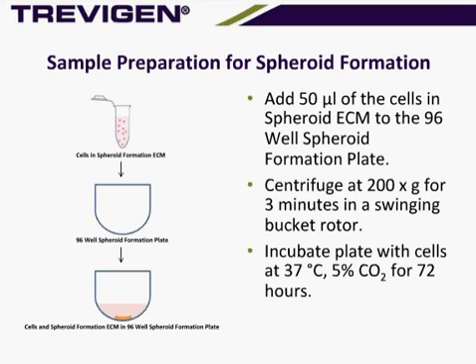We also recommend the swinging bucket rotor specifically because that pulls the cells to the very bottom of the well, which also gives us the best placement for viewing.